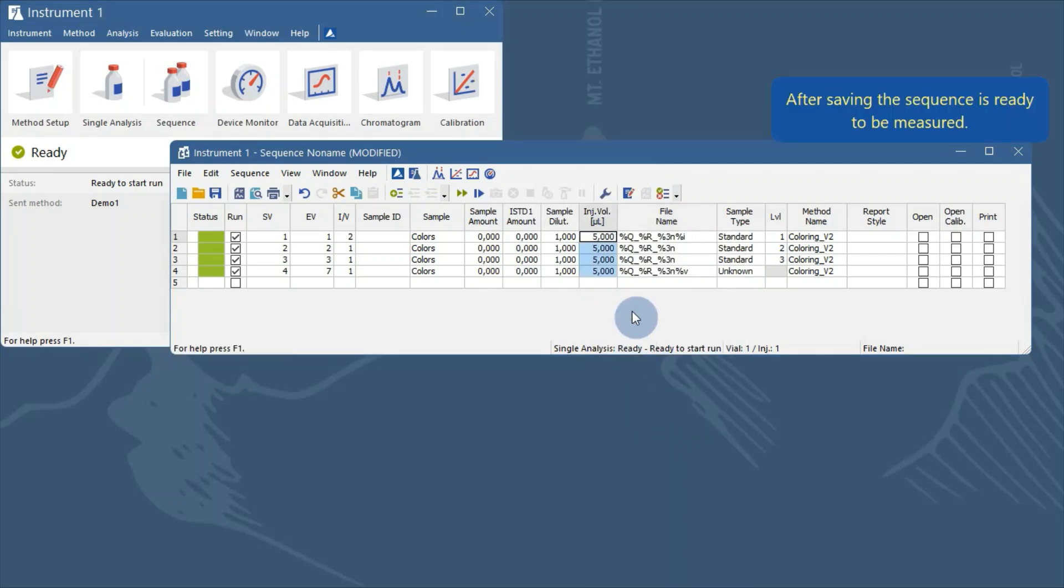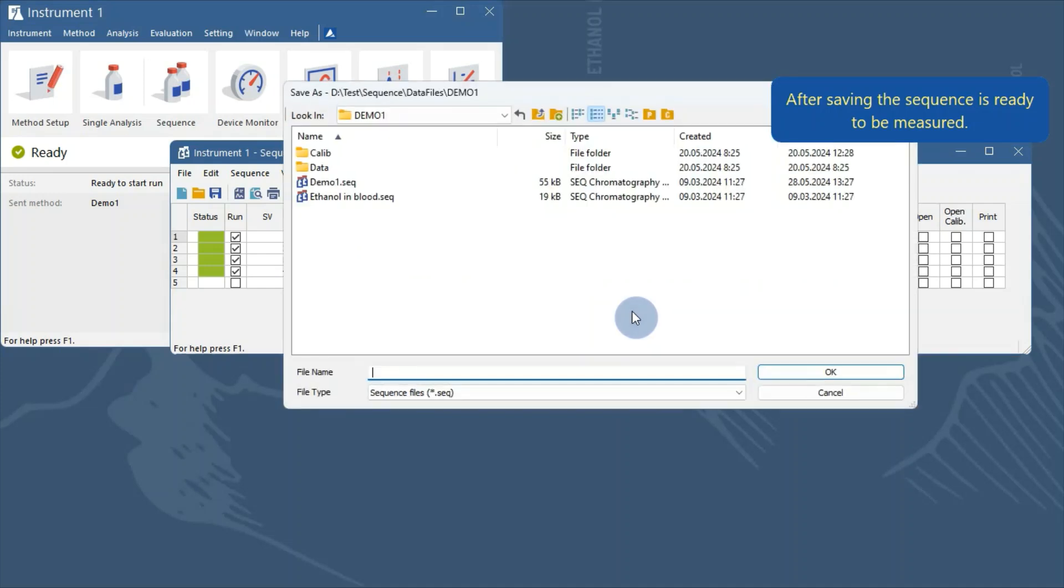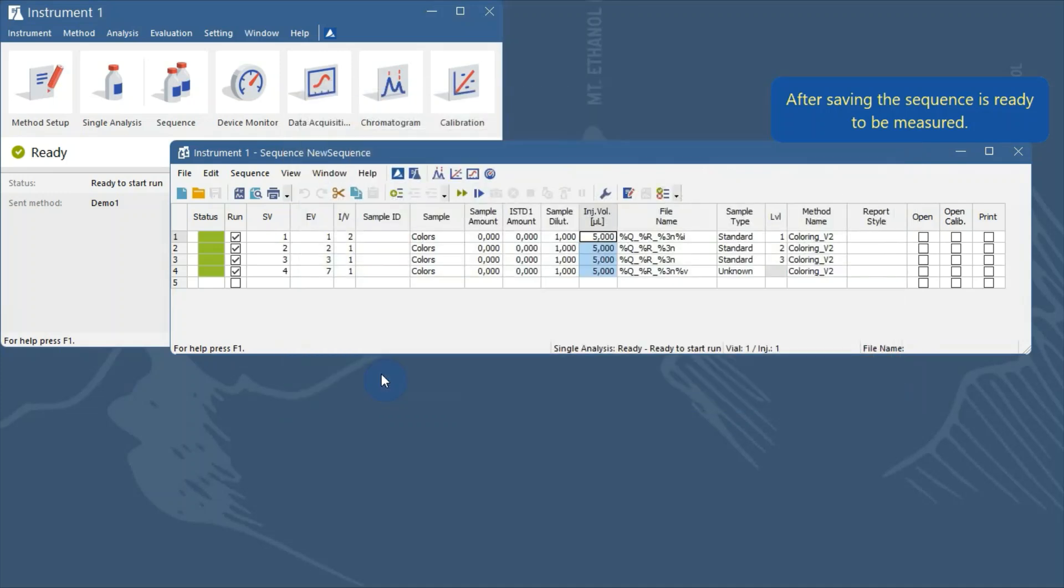Save the sequence under the name you want. Now, the sequence is ready for the measurement.